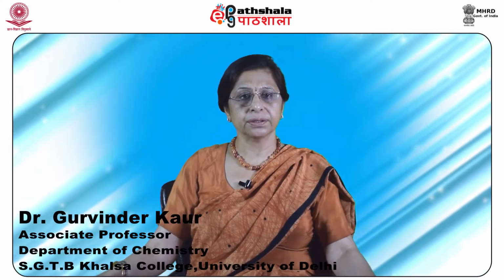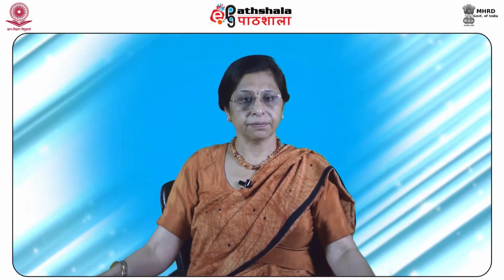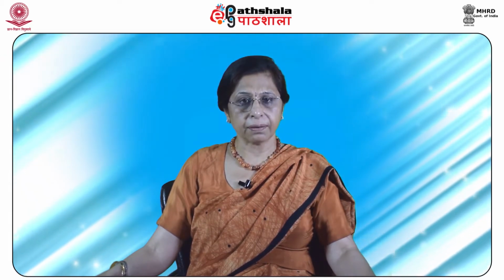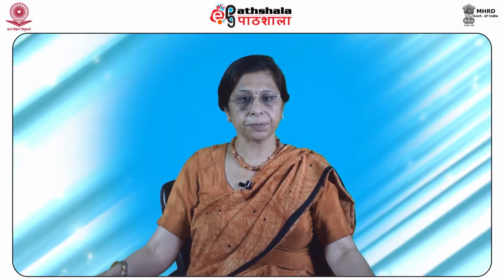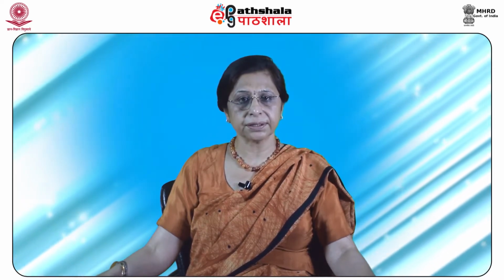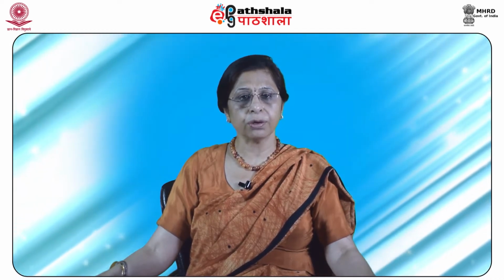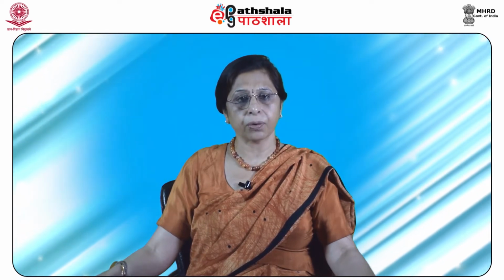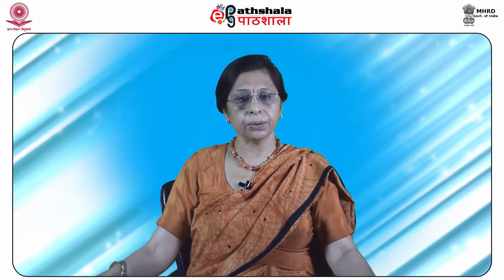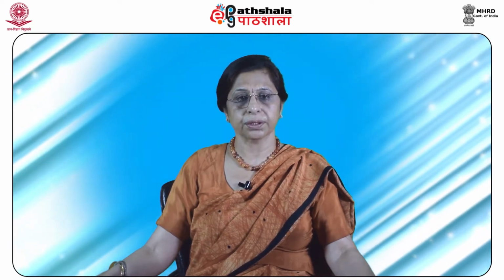My dear students, after studying this module, you shall be able to define spectroscopy, learn basics of ultraviolet visible spectroscopy, learn different kinds of transitions that can take place within the molecule, more so organic molecules which are important from forensic point of view, and you should be able to learn what are chromophores and auxochromes.